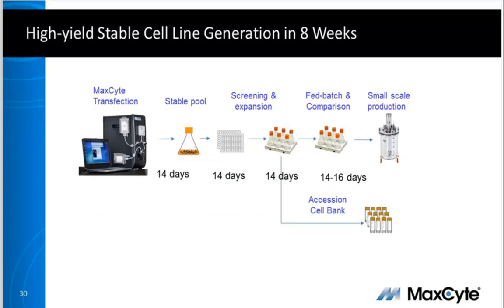In the last set of experiments I'll share, we used Maxcyte transfection to generate stable cell lines through limiting dilution cloning and subsequently characterize the robustness of a high-producing clone. We began by applying selection pressure 1 day after electroporation of CHOZN cells with a bicistronic antibody plasmid. Within 2 weeks, cells recovered from selection and produced a stable pool. At that point, we initiated limiting dilution cloning, and at the end of 8 weeks, the highest producing clone was placed into production culture.